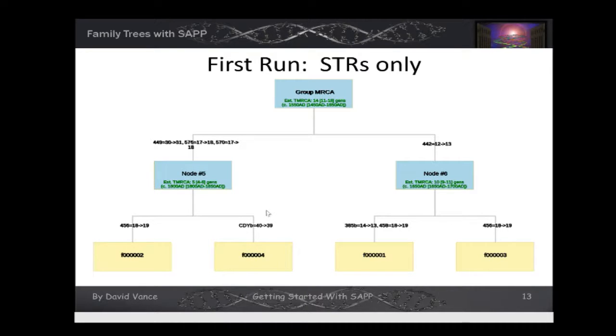But SAPP will try to produce the tree in the smallest size possible, so it will sometimes put the kits up or down the tree where they make sense, where they can fill in the white space that's available to the program for charting purposes. The reason for that is, very quickly, as the number of kits increases, this particular picture can get very large. I believe on the 557 kit input, that's the largest that I know of, if it were printed, it would end up being 4 feet high and 100 feet wide. And obviously that's too big for anybody to usefully process.